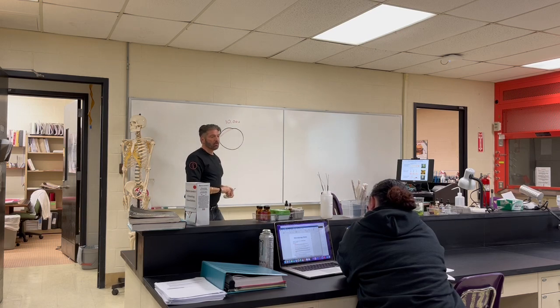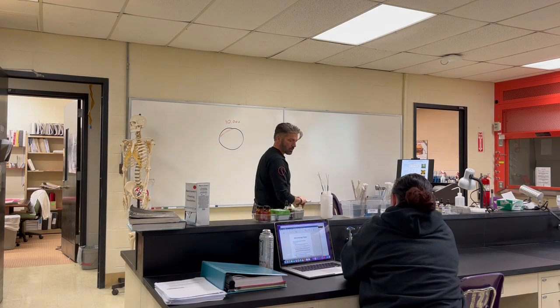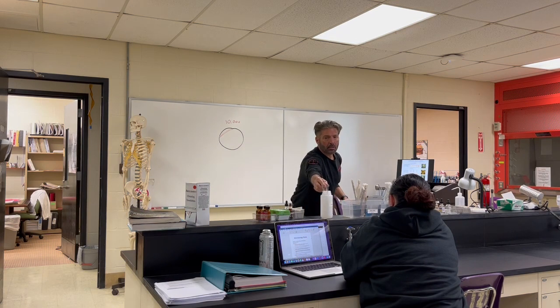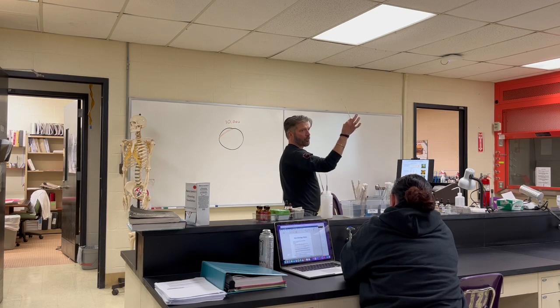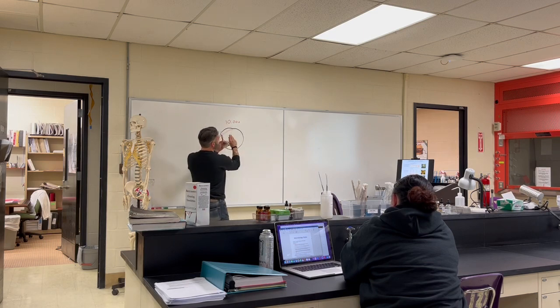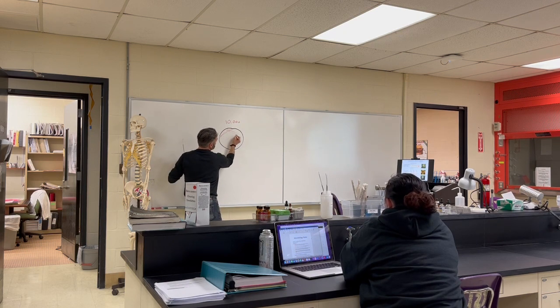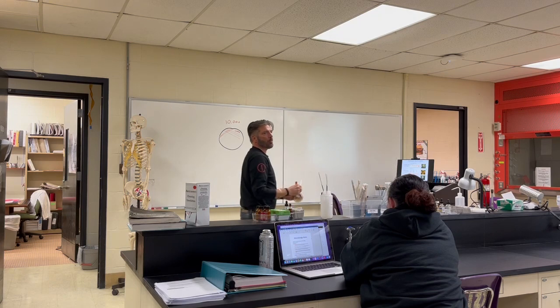Now I'm going to come over here, and this is lit. I'm going to take my inoculation loop. It's red hot. I hold it up. How many bacteria on it now? 0. So I'm going to take this, and there's none on it, and I swab it like that. How many bacteria do you think I have there? Doesn't matter. 1,000. I flame it again. It's red hot, 0 bacteria.